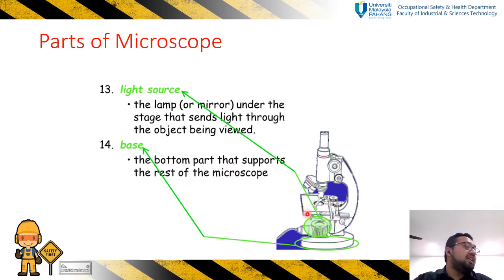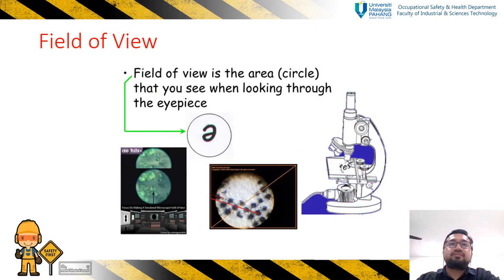So basically, semua ini adalah what we call parts of light microscope lah. Bukan, kita ada beberapa jenis microscope yang lebih kompleks, yang lebih boleh nampak lebih detail, but this one is what we call basic part of the light microscope.